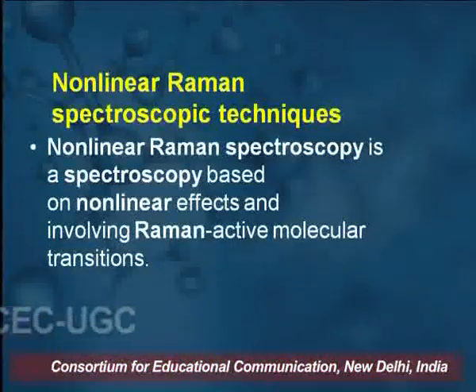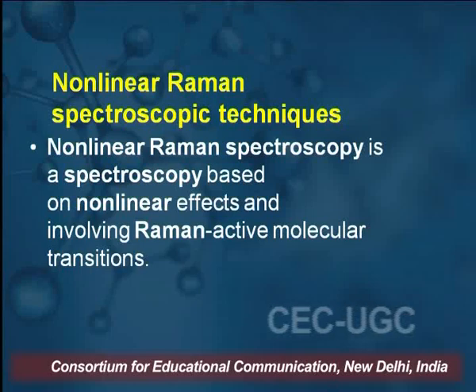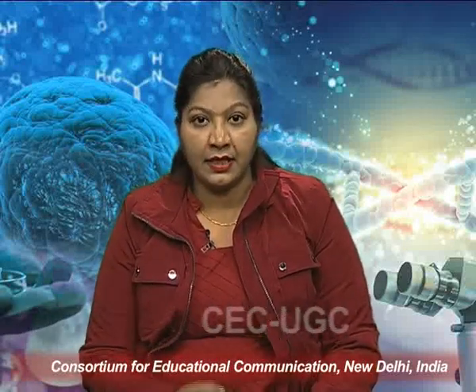Next is the non-linear Raman spectroscopic techniques. Non-linear, why are we dealing with that? In the pre-laser era, we dealt with conventional light sources, but after the discovery of the laser, we are dealing with non-linear optics. In non-linear optics, the Raman scattering is defined as non-linear Raman scattering, and that technique is known as the non-linear Raman spectroscopic techniques.